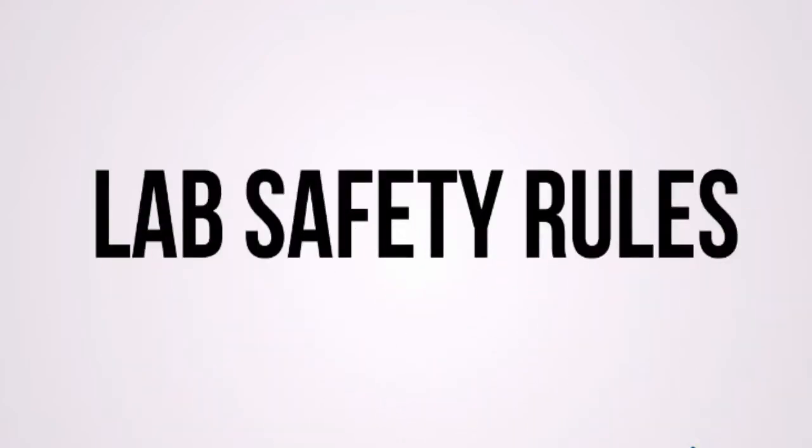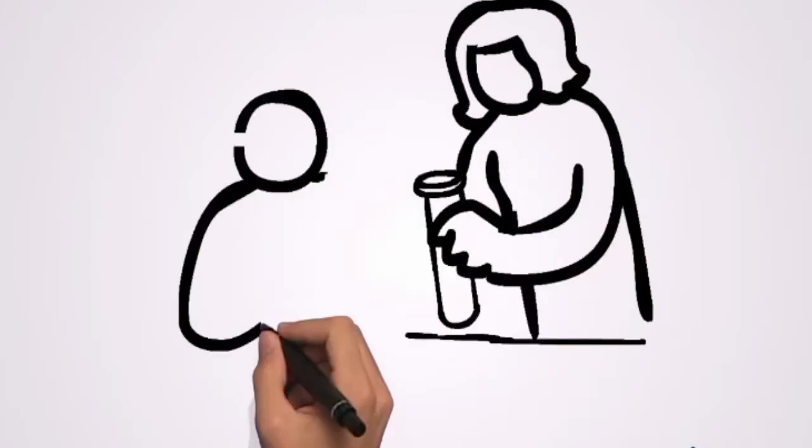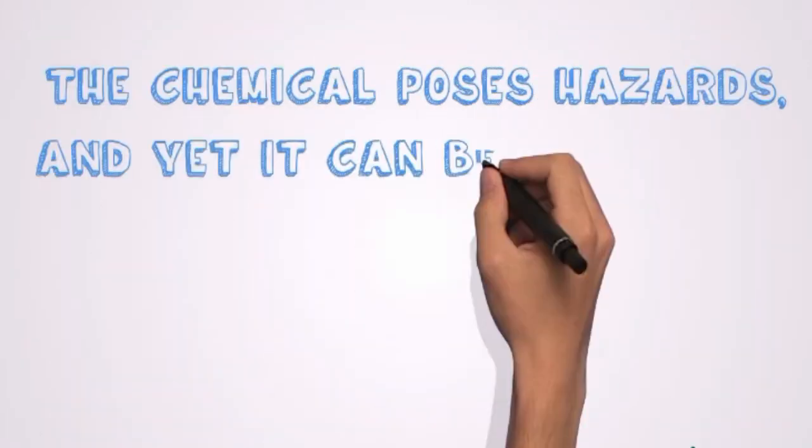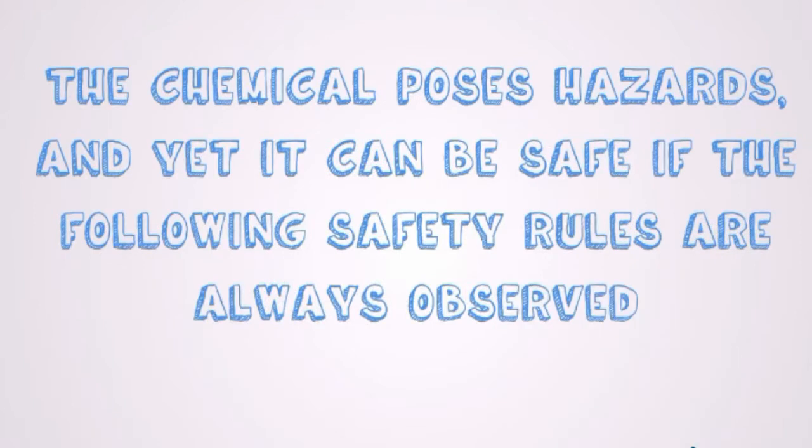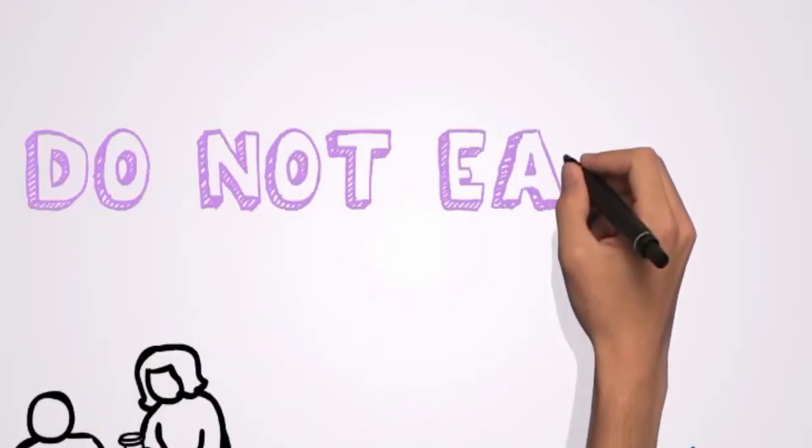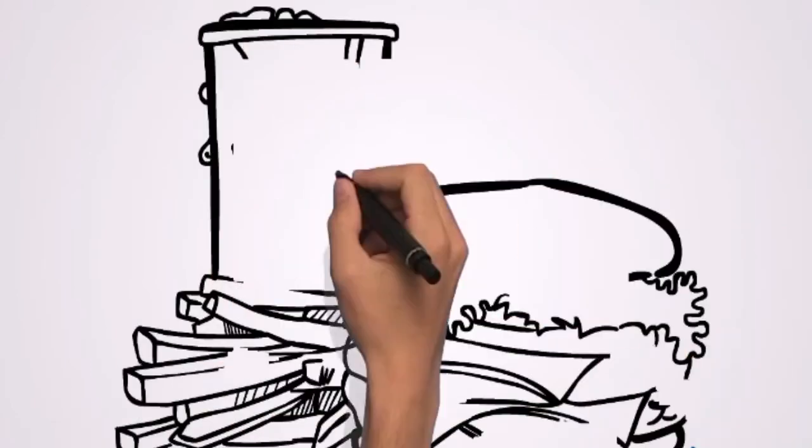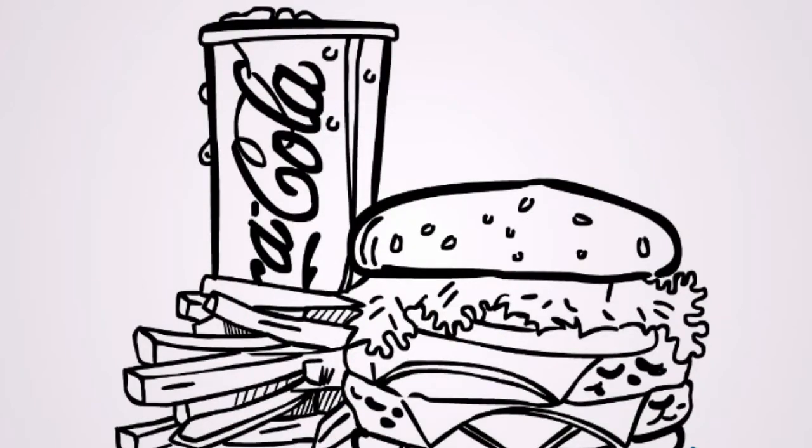Lab safety rules: The chemical laboratory poses hazards, and yet it can be safe if the following safety rules are always observed. Rule 1: Do not eat or drink anything in the laboratory. This applies to both food and chemicals. The obvious danger is poisoning.